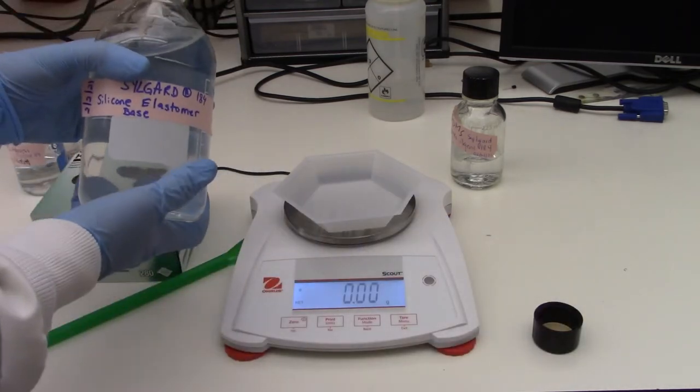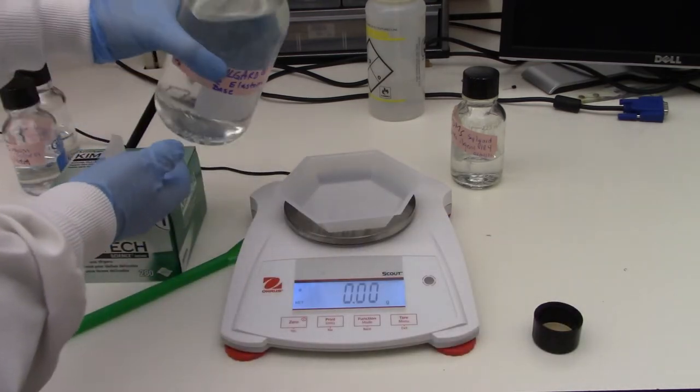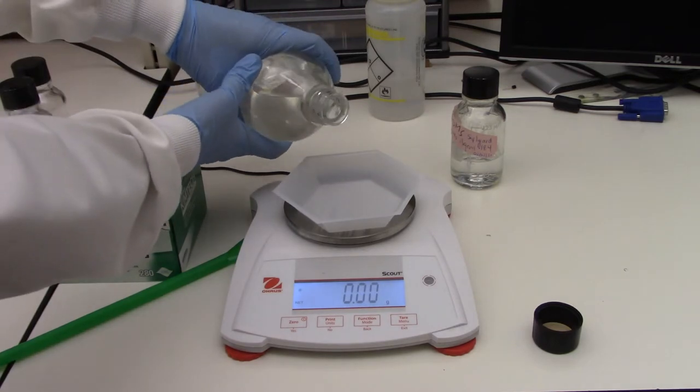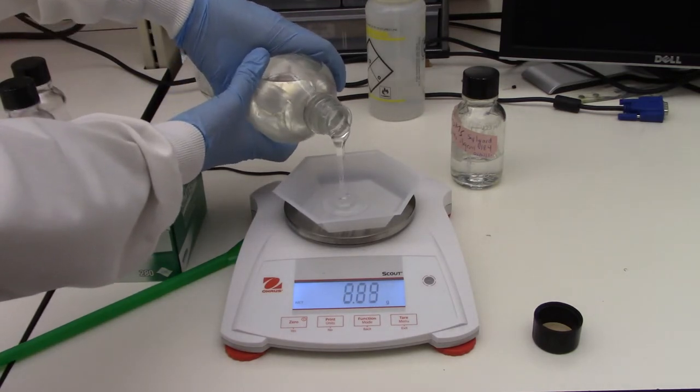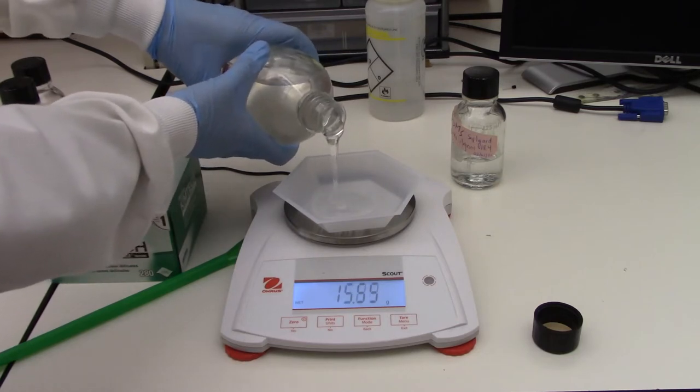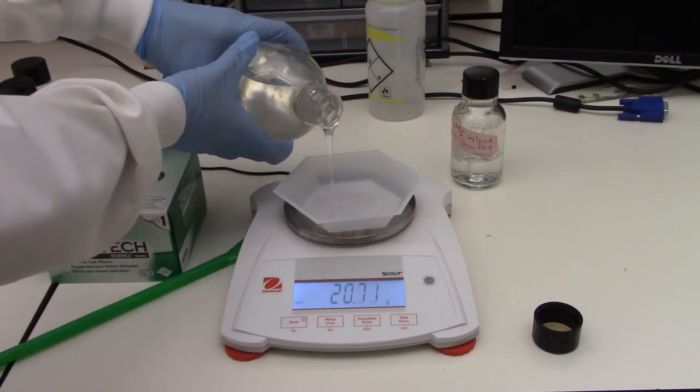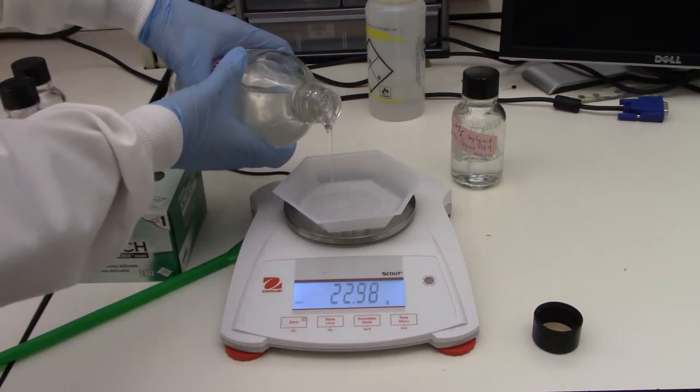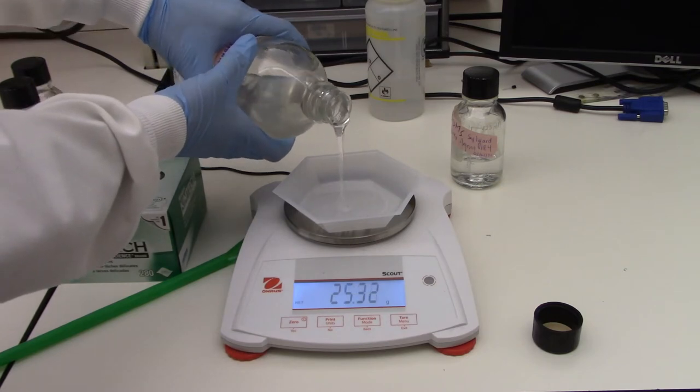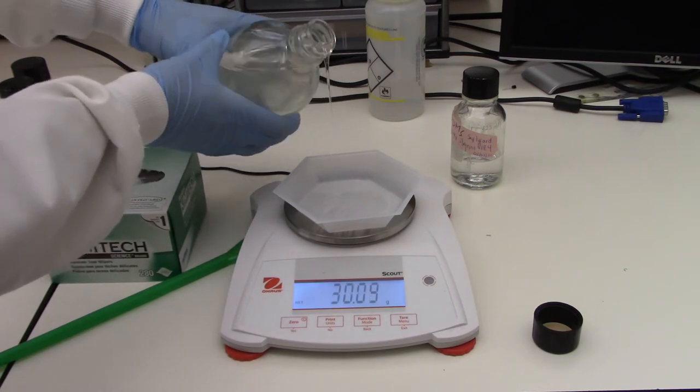When you're pouring this, this PDMS base is a very viscous liquid. You can see it's going to come out kind of more with the consistency of honey. And then as the numbers go up, I'm going to kind of watch it as it gets close to 30 grams.